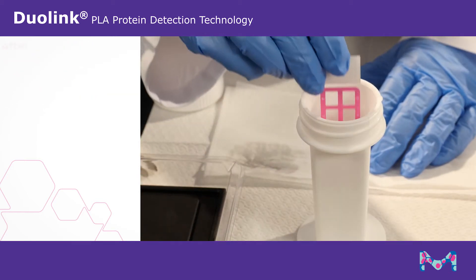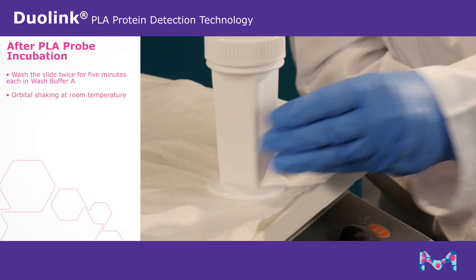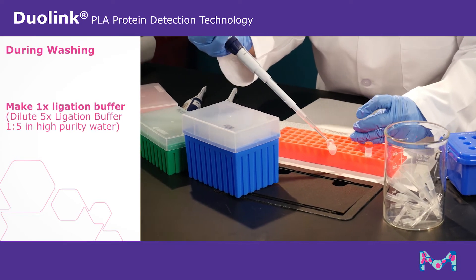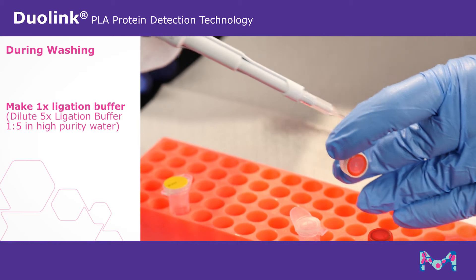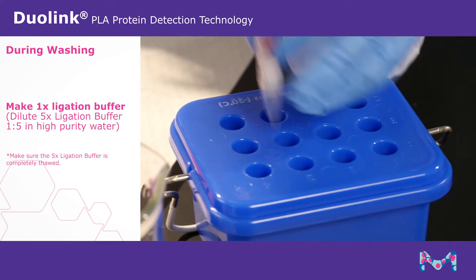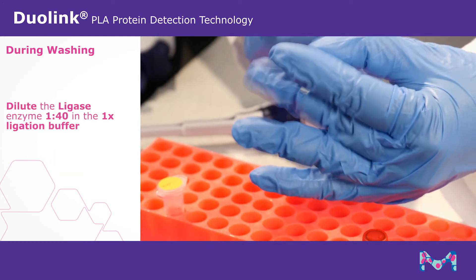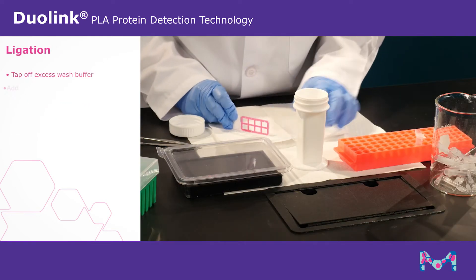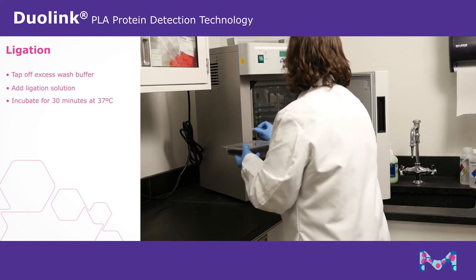After incubation, wash the slide twice for five minutes each in wash buffer A with gentle orbital shaking at room temperature. During washing, make 1X ligation buffer by diluting the 5X ligation buffer 1 to 5 in high purity water. Make sure the 5X ligation buffer is completely thawed with no visible precipitate prior to dilution. Dilute the ligase enzyme 1 to 40 in the ligation buffer. Tap off excess wash buffer, add the ligation solution to each well, and incubate for 30 minutes at 37 degrees Celsius.